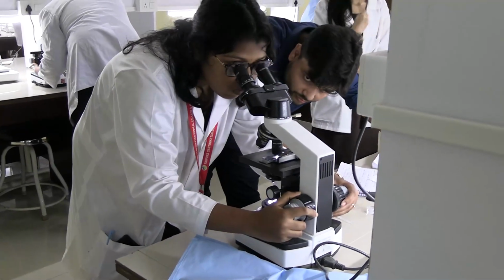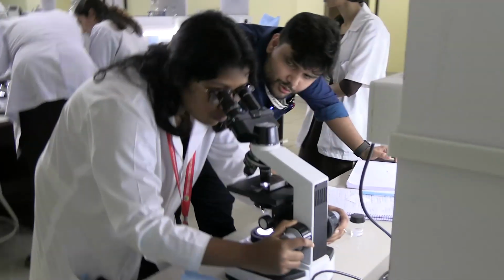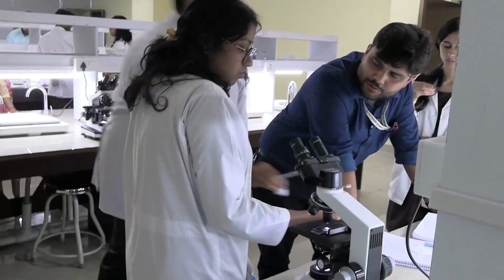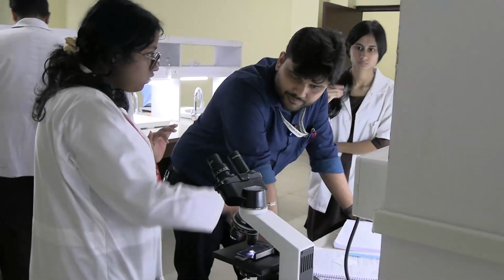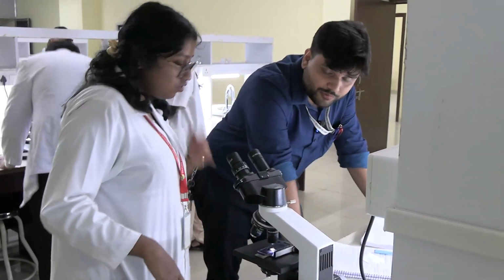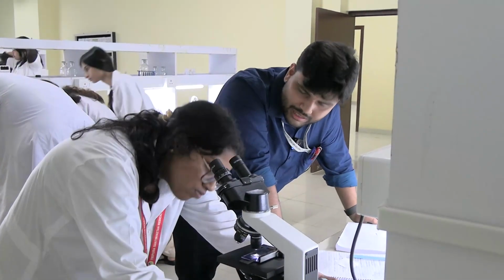Is it the right way to see? I don't want to break this also. No, no. What is the use of oil in case of oil immersion? Sir, the refractive index of the light and the oil is same, so we can see clearly. Refractive index of the glass and the oil is same. Same. So if there is a gap of air between your oil and the lens, will the oil work? No, sir. So there is a gap between the oil and the lens.